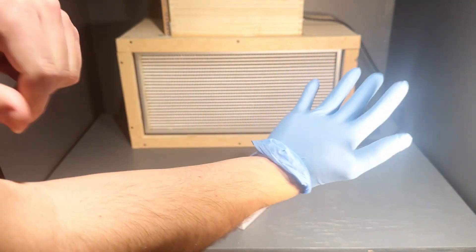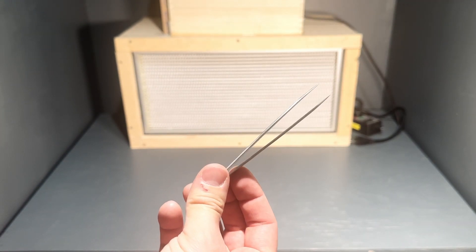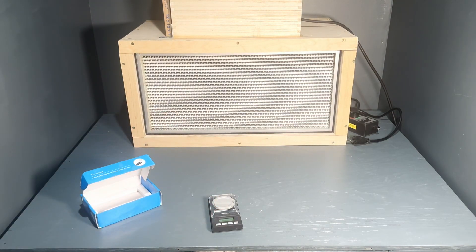Mason jars, latex gloves, forceps, anti-bacterial dish soap, measuring cups, and a scale — I recommend a digital scale. So all of that together was around $326 to get started.